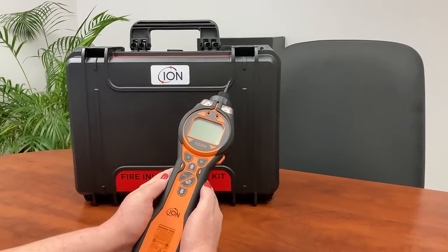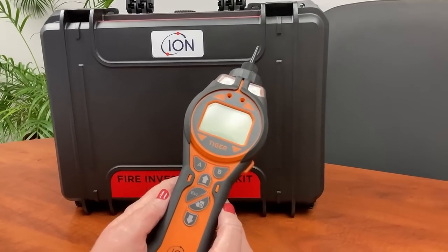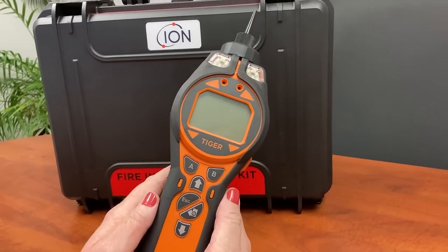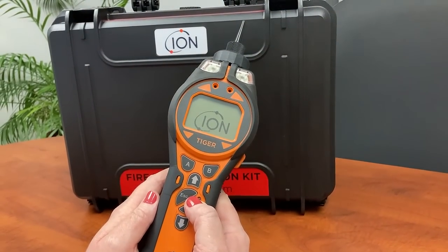This video is on the Tiger PID VOC detector from Ion Science. We are doing two videos: the first one is on the operation of the instrument and the buttons, how to use it, and the second one is on the software to download and create a report.